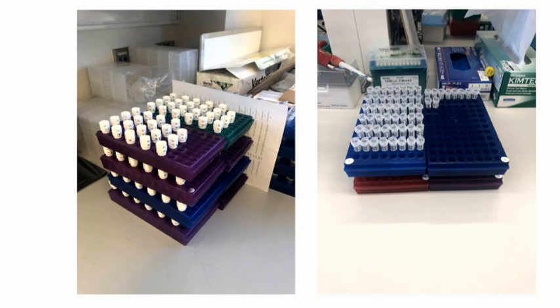This is just some pictures I grabbed on Friday showing how we queue up the tubes that are used for the focused acoustic, AFA. I'll just say AFA. For the AFA work, that's where the tissue goes into the tube. All the tubes are 2D barcoded, from Covaris, but they're also labeled by hand in ink or Sharpie, so they're human readable as well.